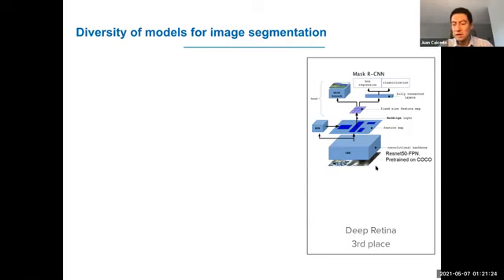And the way it works is that it looks at one image and it decomposes the image into sub-regions. That's the R in the Mask RCNN procedure. These are the regions where the system believes there may be some objects of interest. So there is one region proposal network here, which takes the features from the convolutional neural network and generates some candidates.